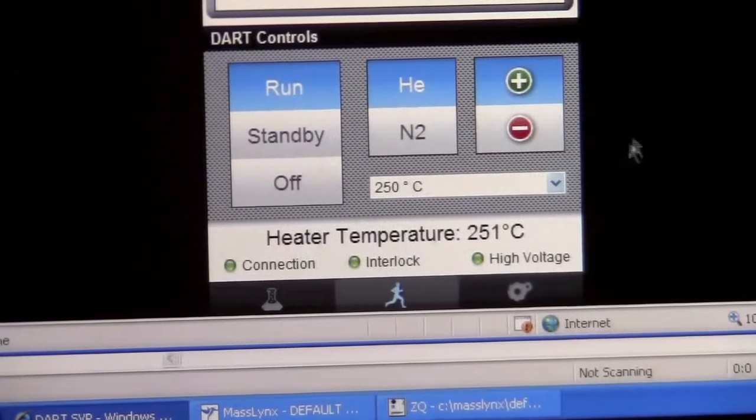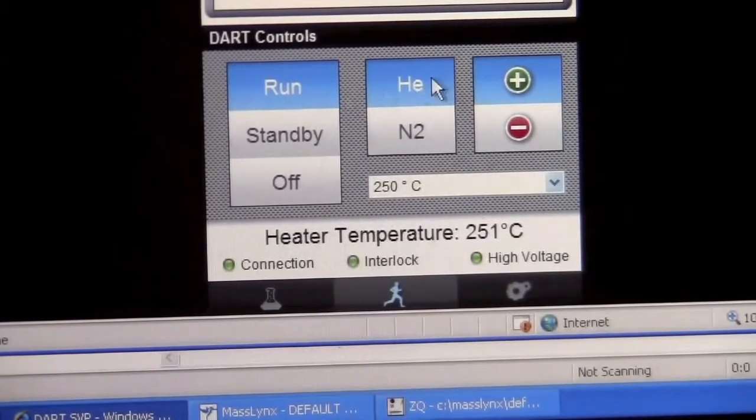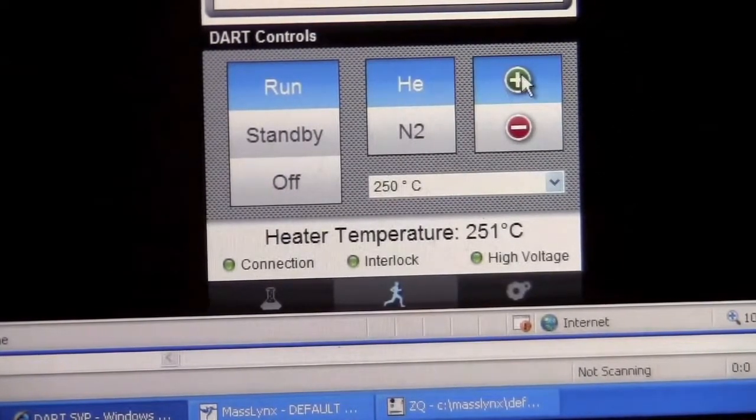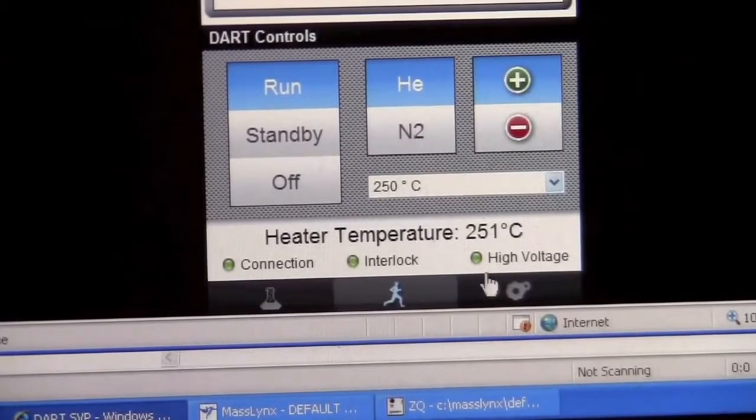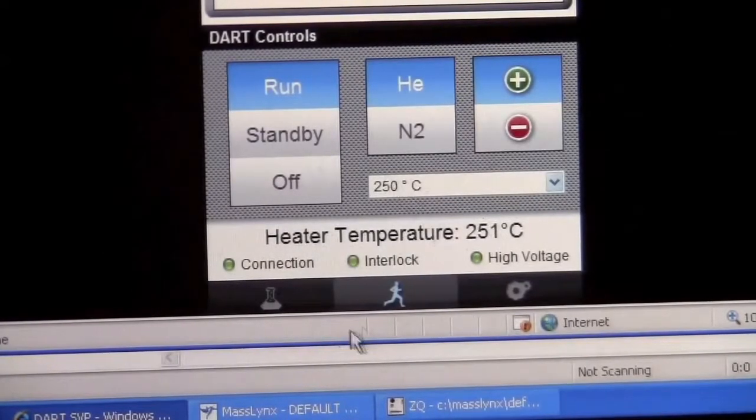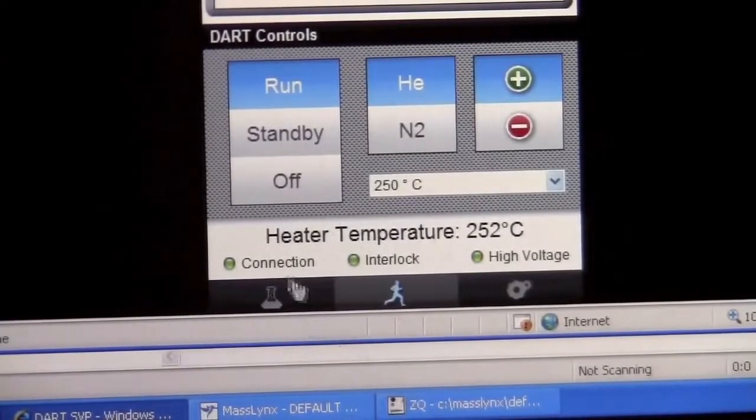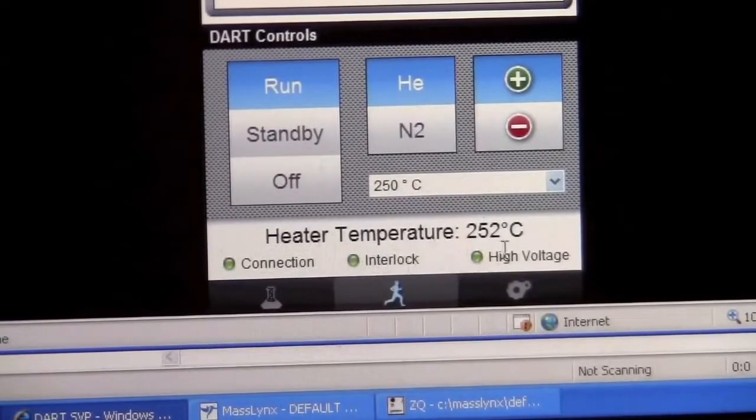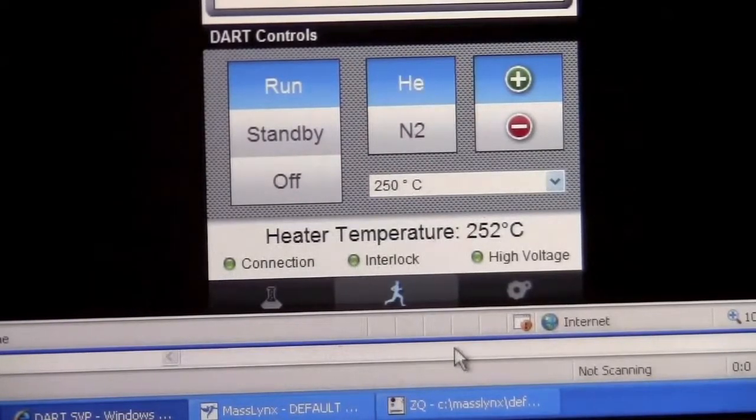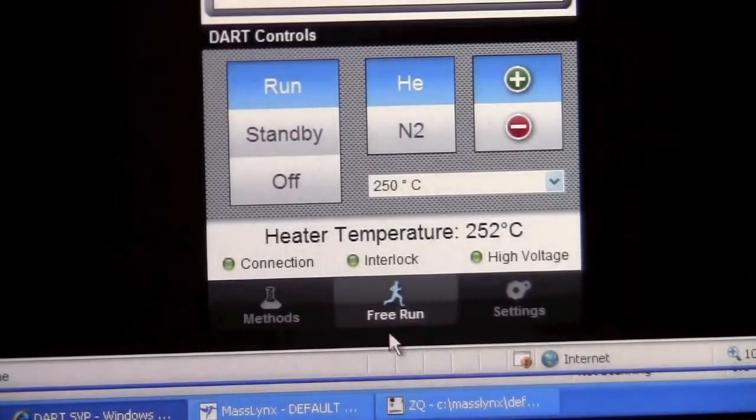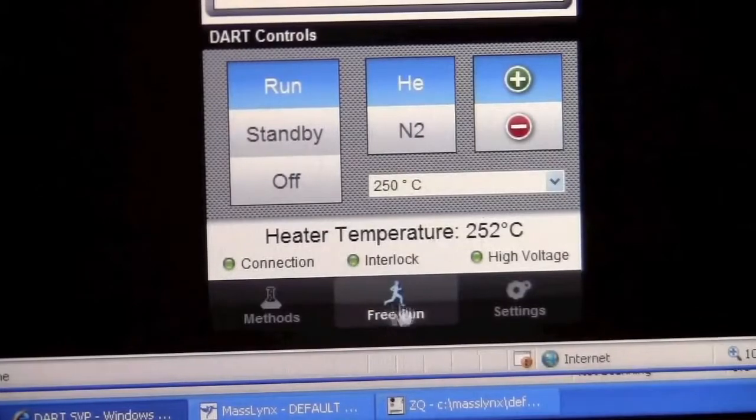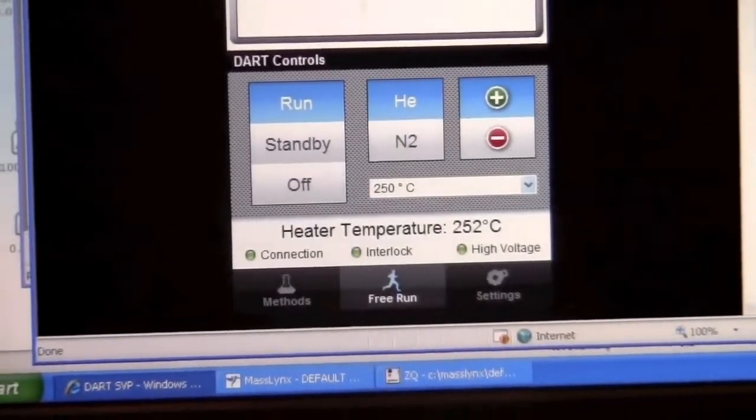So in this case, the source is producing ions. It's on run helium with positive ions. The temperature is set where we want. The connection is green. Interlock is green. High voltage is on. And we have free run mode. So the source is producing ions.